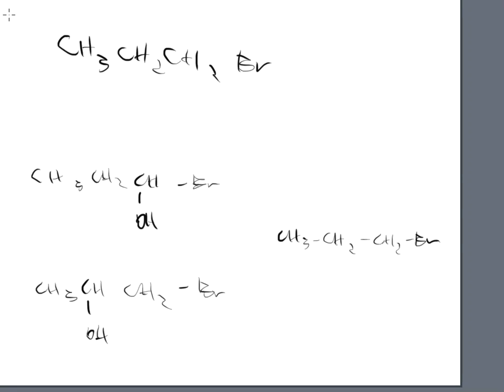And then in this one, that goes from a 3 to a 2. And then we also have the group here. Now, I chose OH. You could choose another bromine. I don't care what you do. As long as you know which bromine you've added on and how you compare them, that doesn't really matter. So I could do a bromine, I could do a chlorine, I could do any group that I'm comfortable with as far as nomenclature. So now the question is, how many different signals do I get?